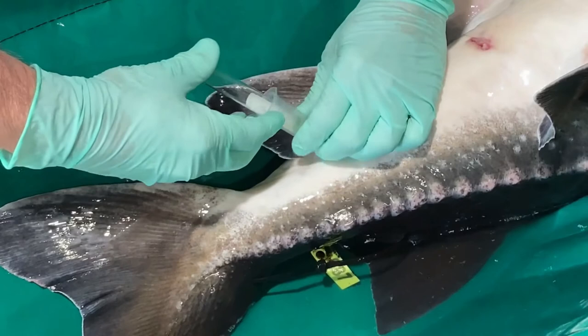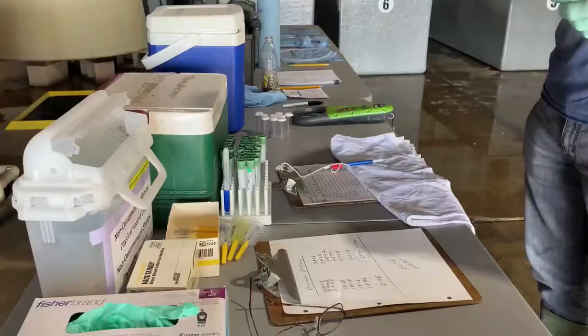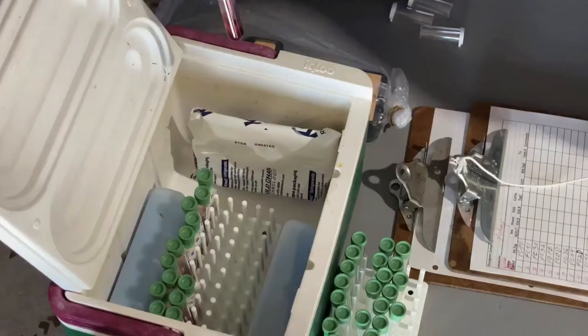Remove the vacutainer first and then remove the needle separately. This prevents the vacutainer from drawing other tissues into the blood sample. Invert the sample a couple of times to ensure mixing of the heparin with the blood.